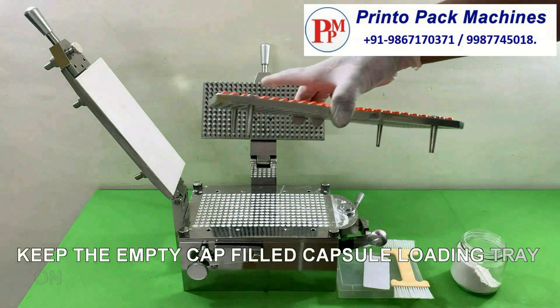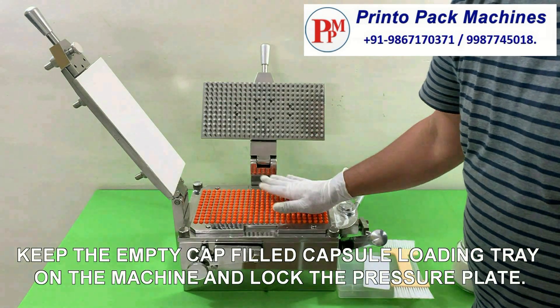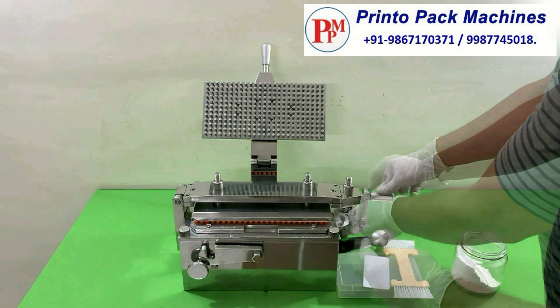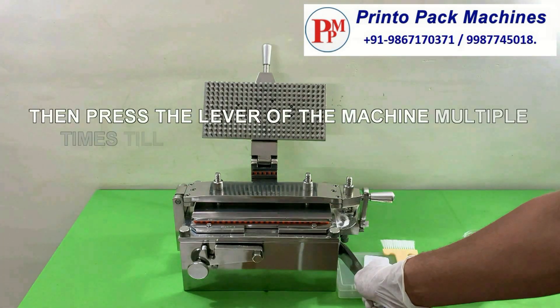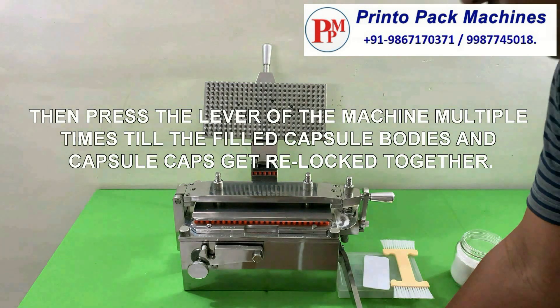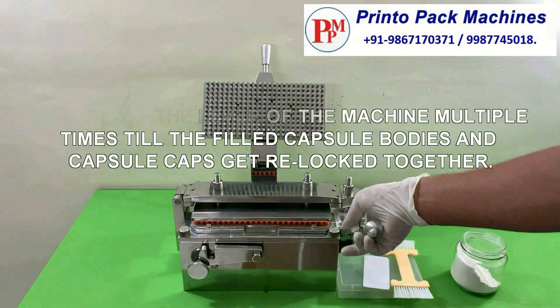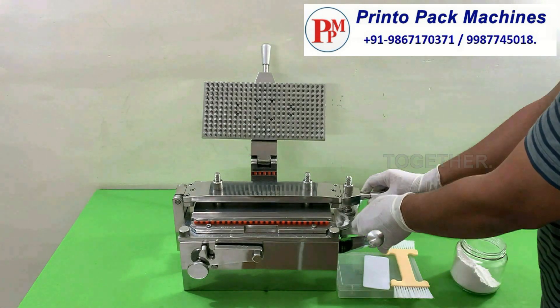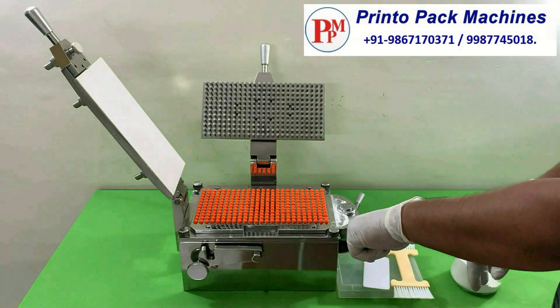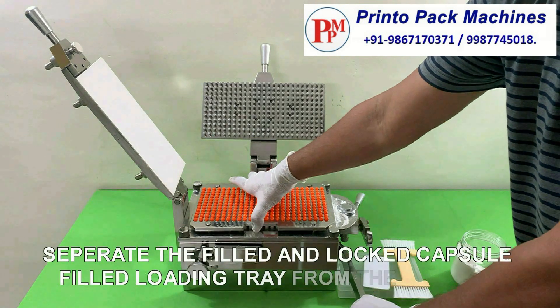Keep the empty cap filled capsule loading tray on the machine and lock the pressure plate. Then press the lever of the machine multiple times till the filled capsule bodies and capsule caps get relocked together. Separate the filled and locked capsule filled loading tray from the machine.